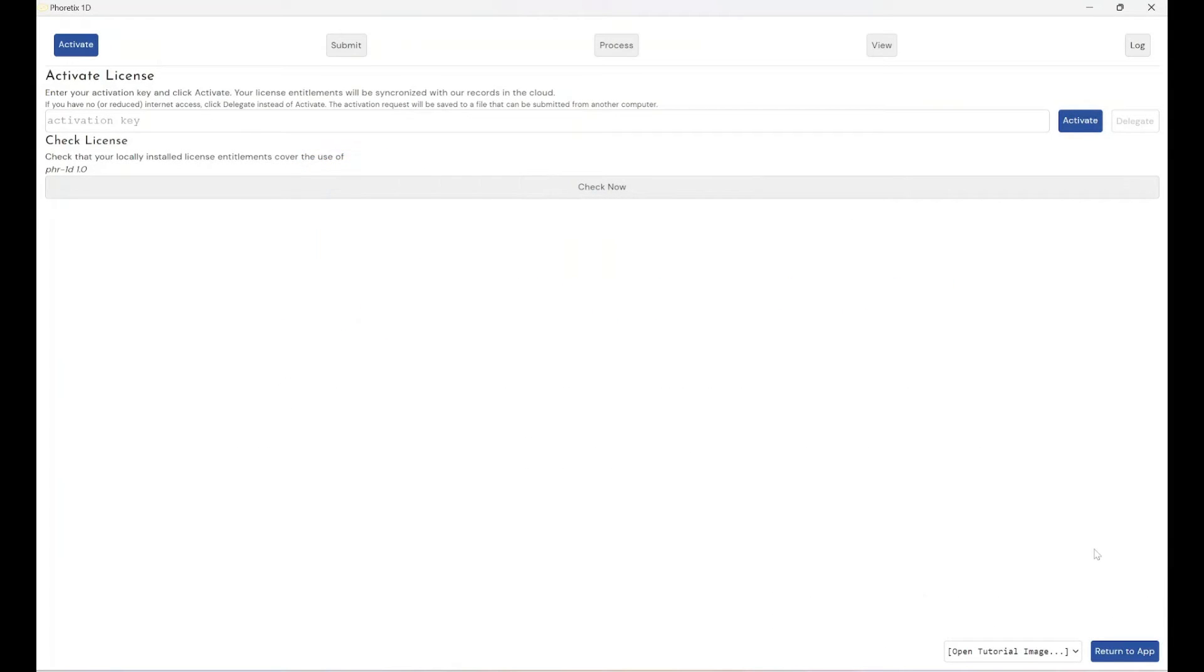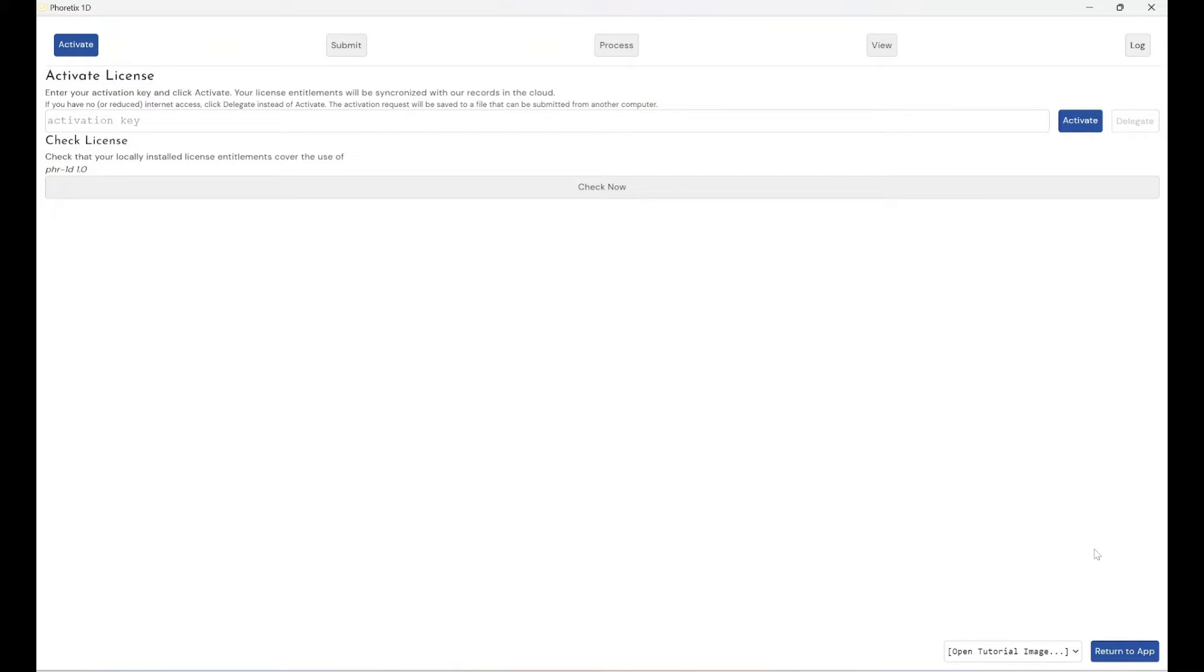Today I'm going to be showing you how you can get a free copy of our next generation advanced immunoblot and electrophoresis analysis software for Phoretics 1D. Now of course you can request a free trial for seven days that will allow you to test out the software within your own lab environment on your own images. However, we've also built in a second avenue to free usage of our software and that's to cover academic use.